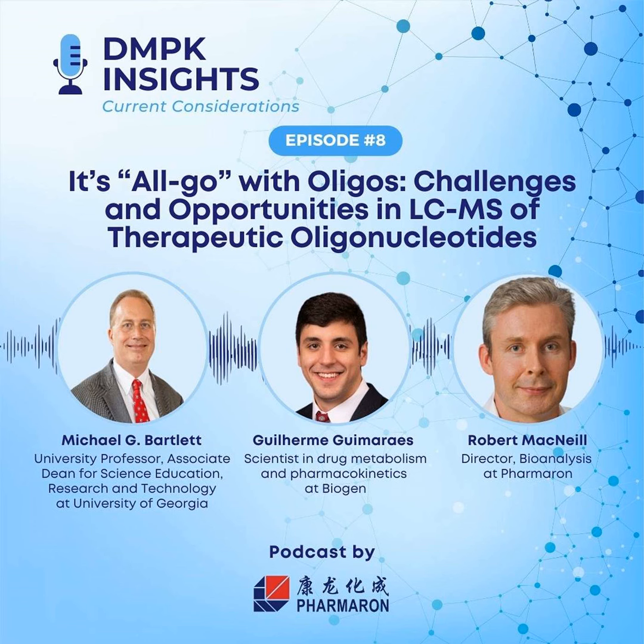We all recognize the advantages that come from doing lower flow rate, micro and nanoscale, both separations and electrospray, in particular, because again, you're going to get better efficiency in your chromatography, and in particular, you get smaller droplets in electrospray, so you get more surface area, so you get better ionization. So I think the practical aspects are pretty attractive for us to try. But as you said, robustness is the issue of the day. But we went through the same sort of growing pains as we tried to start shrinking HPLC columns, right?